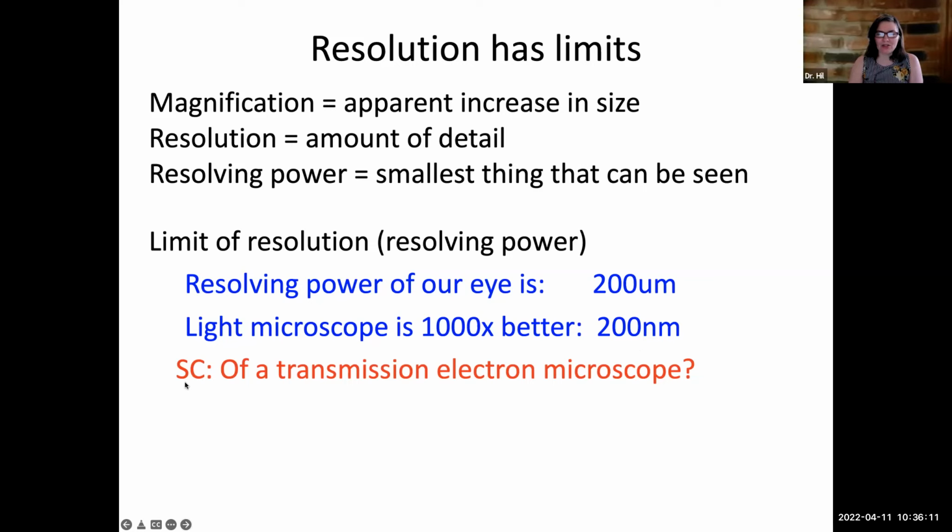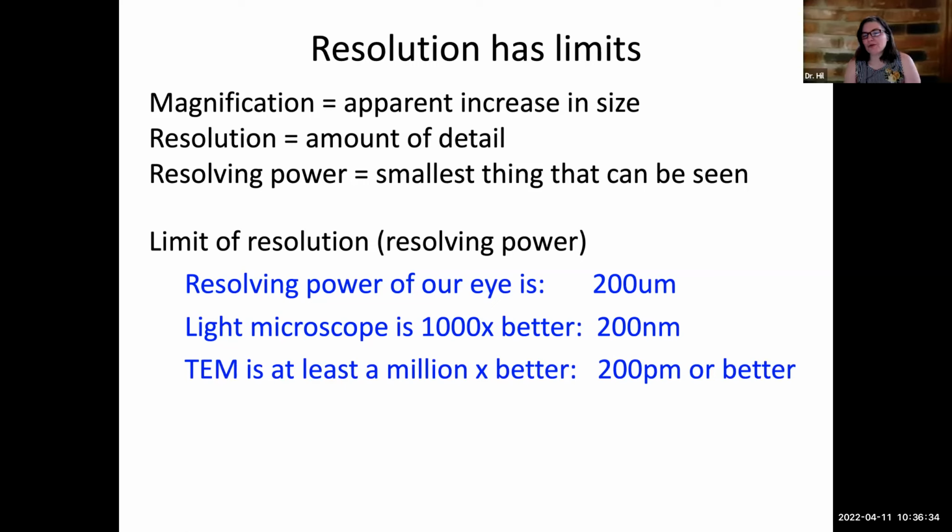Now compare that to a transmission electron microscope. Transmission electron microscope, RP is what? Yeah, 200 picometers or better.